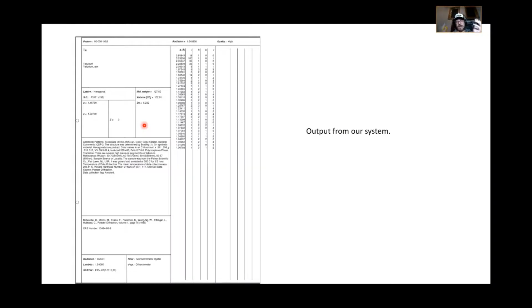The way we identify our materials is basically a lookup system. You get a spectra on your sample and you compare it with a library spectra. You can also compare to different cards, so you can calculate your own d-spacing and see if your sample matches what's in the database. So spectroscopy, in a lot of ways, is comparing with lookup tables, or known data, to figure out what you have.